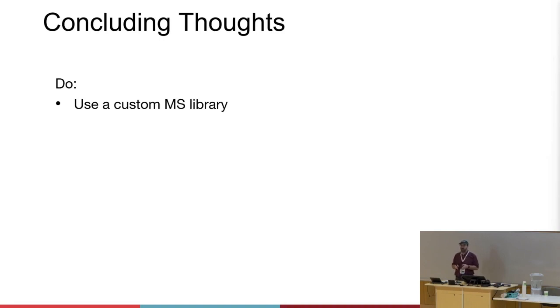Plus or minus 2 probably is what we're going to use for a lot of our stuff going forward. So now you're really zeroing in on what these specific compounds are, and your isomers should be really easy to sort out every time without you having to do a lot of manual reviewing of your data.